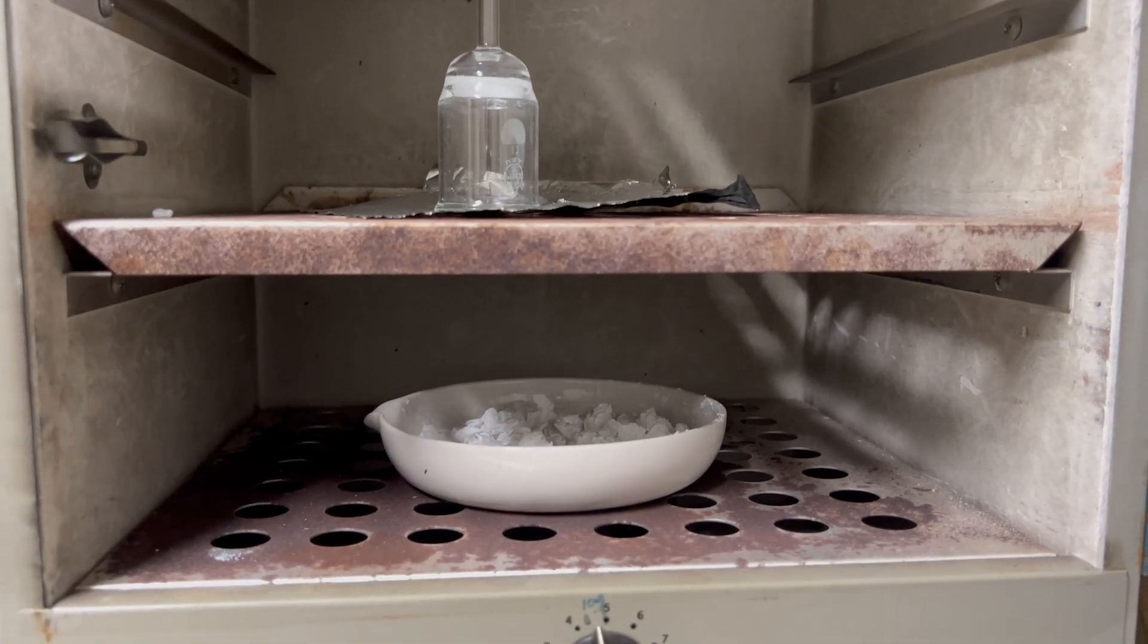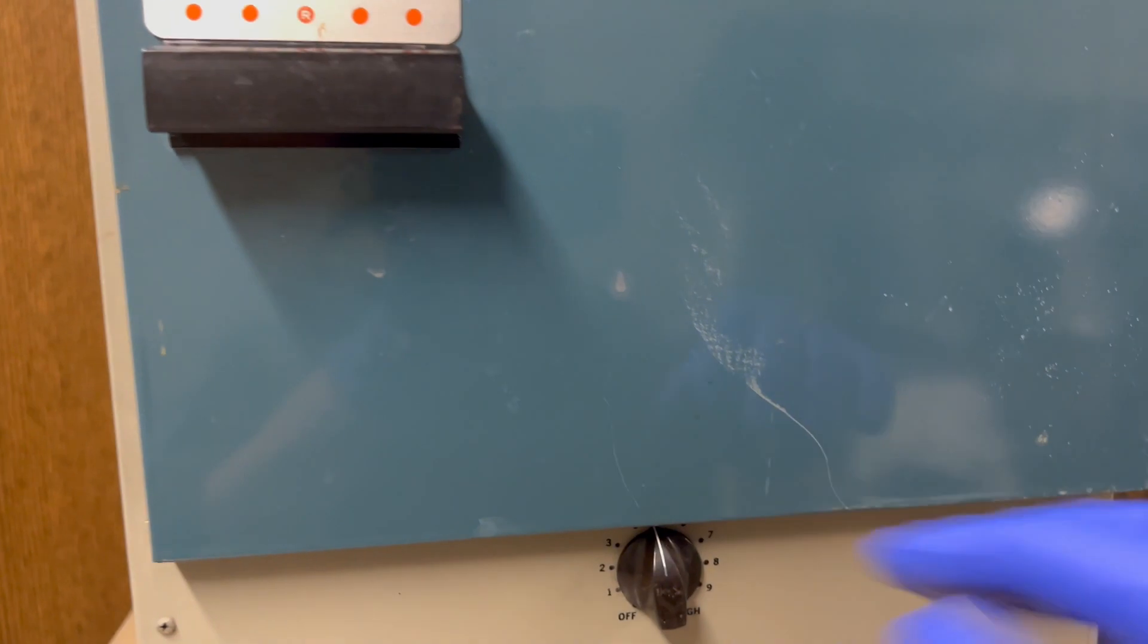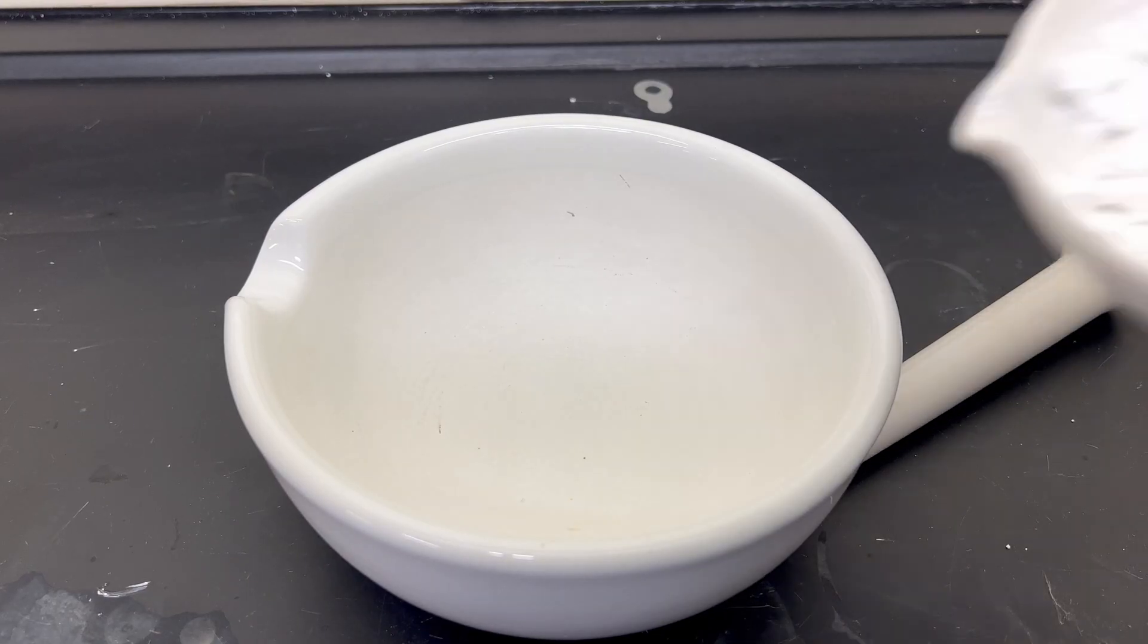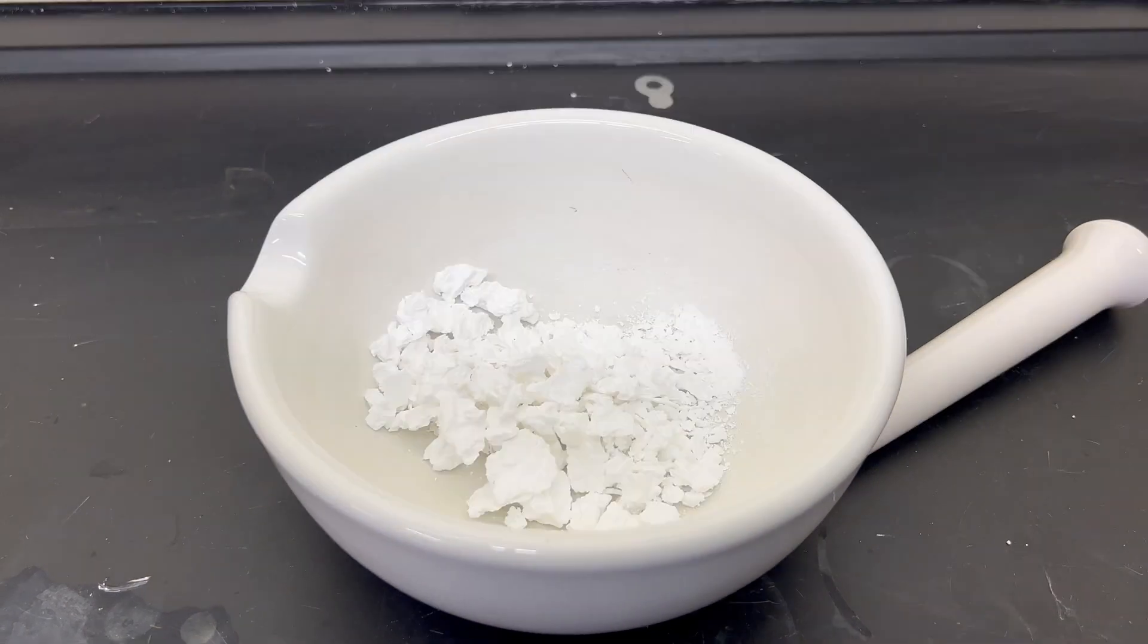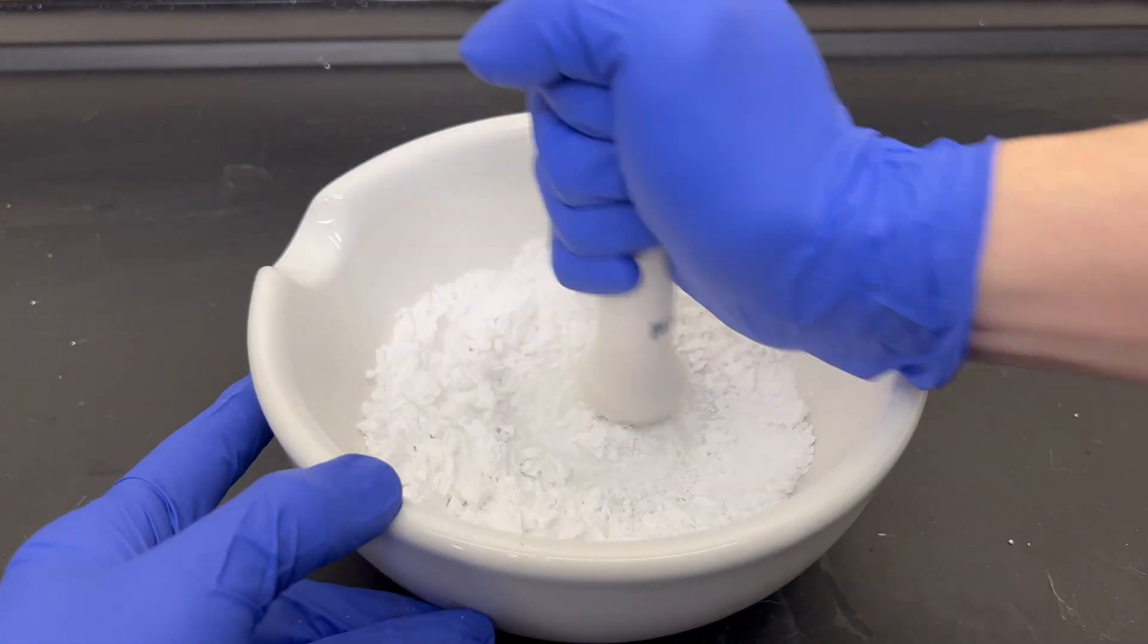The sodium benzoate and sodium hydroxide mix is then placed in a drying oven to drive off any leftover water. Once dry and cool, the sodium benzoate and hydroxide are ground to a powder in a mortar and pestle.